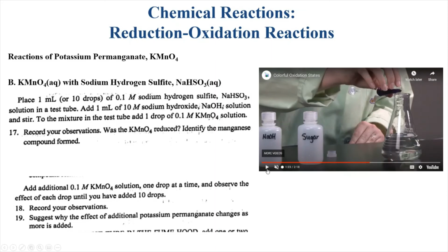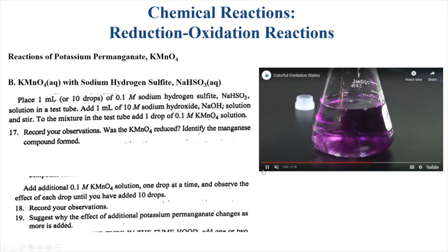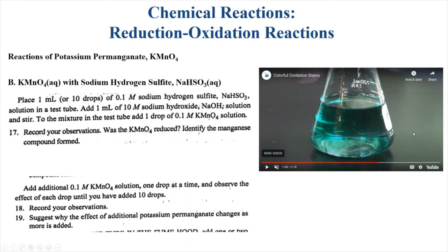Then when we add our potassium permanganate in, it's going to start to react, and we're going to generate some products. After adding however many drops they added, we've gotten this green color. So presumably we've reacted all of the KMnO4, that's gone away, and it's made whatever product it's going to make, and you can determine that based on the color.